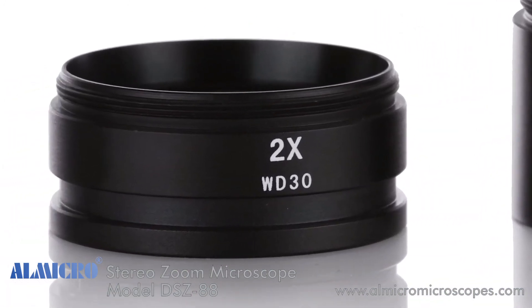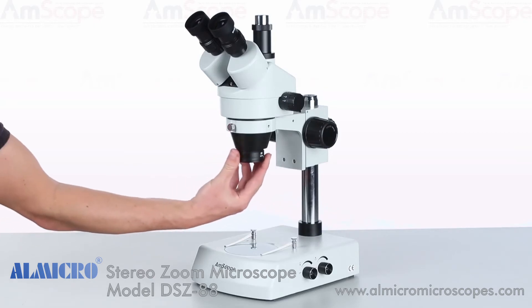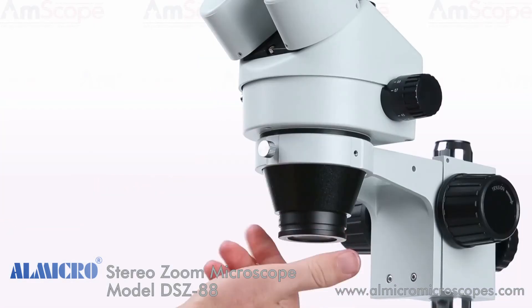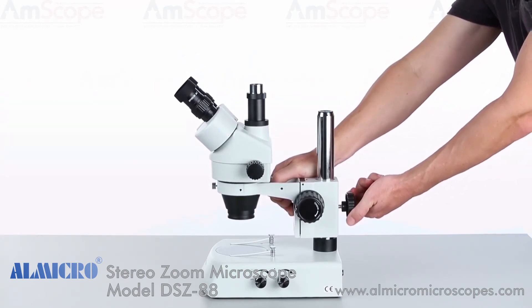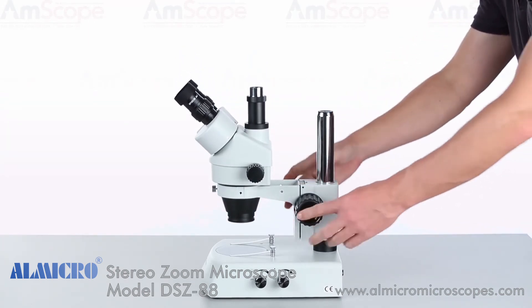The 2x Barlow lens will double your magnification. The increased magnification will require a shorter working distance, so the focusing rack will need to be lowered.